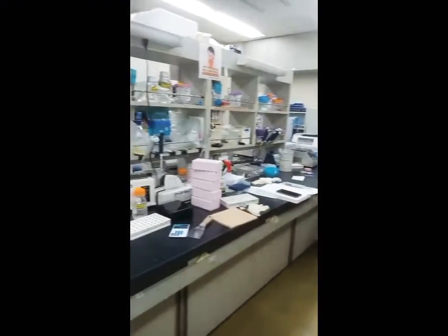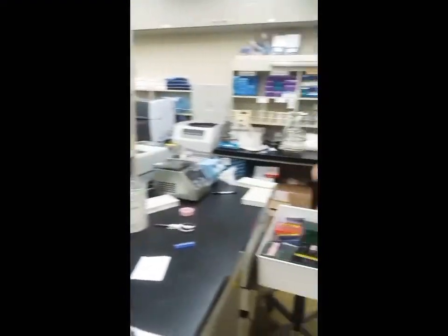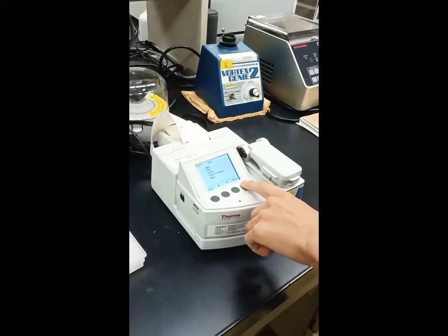Today we will learn how to operate the NanoDrop tool so you can quantify your DNA sample and check the quantity, then compare with the result of PCR later. This is a product from the Thermo Fisher brand. The quick assessment from this tool is amazing, but we still need to confirm the results by using PCR. Let's see how to use it.